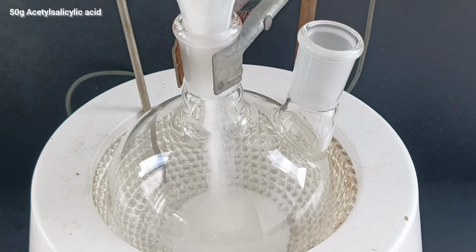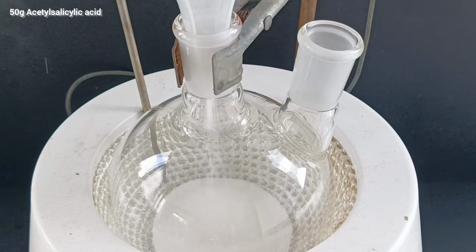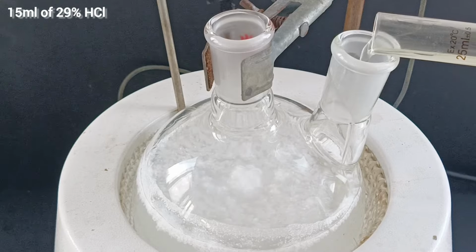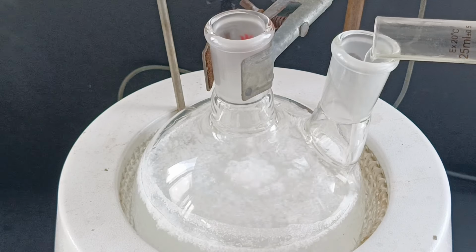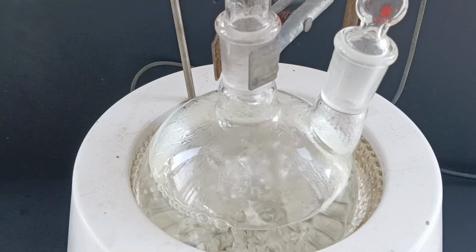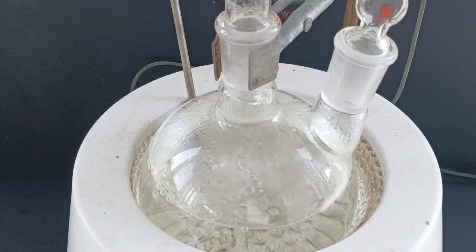I first added 50 grams of acetylsalicylic acid to a large round bottom flask, followed by 700 ml of distilled water and 15 ml of concentrated hydrochloric acid. I then add a condenser on top of the flask and turn on my heating mantle. Once the water starts boiling, all of the aspirin is going to dissolve.